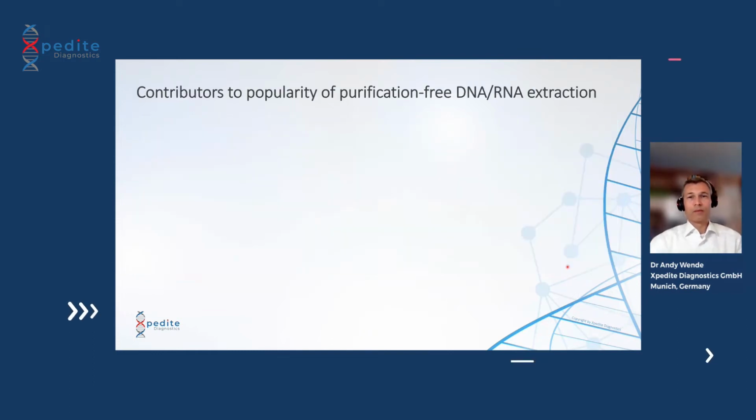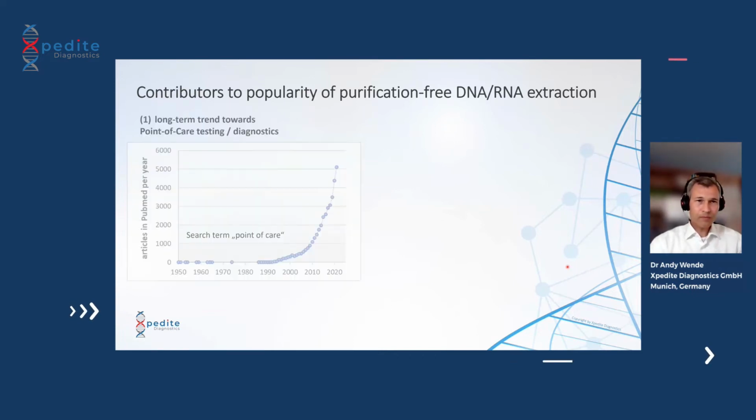So what are the actual contributors to the increasing popularity of these purification-free or direct extraction methods? First of all, you see a very long-term trend over the last more than 20 years of increasing publications, so increasing interest about point-of-care diagnostics, point-of-care testing.